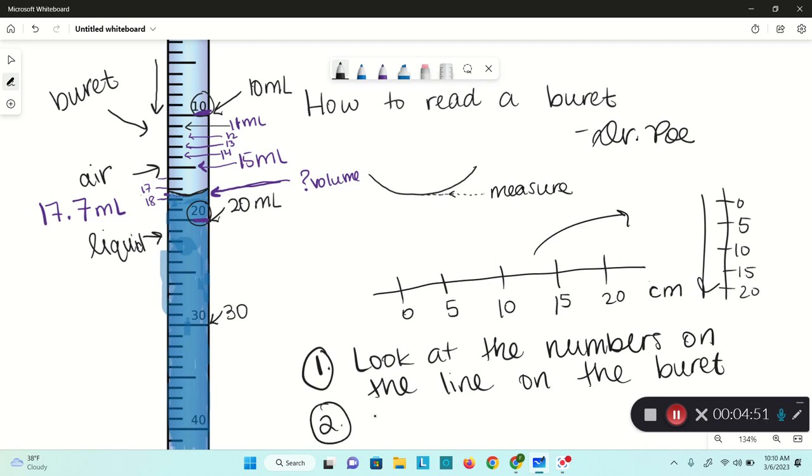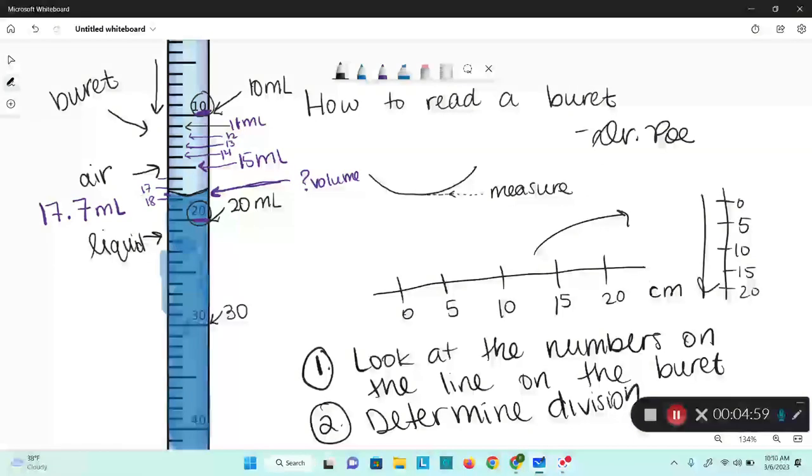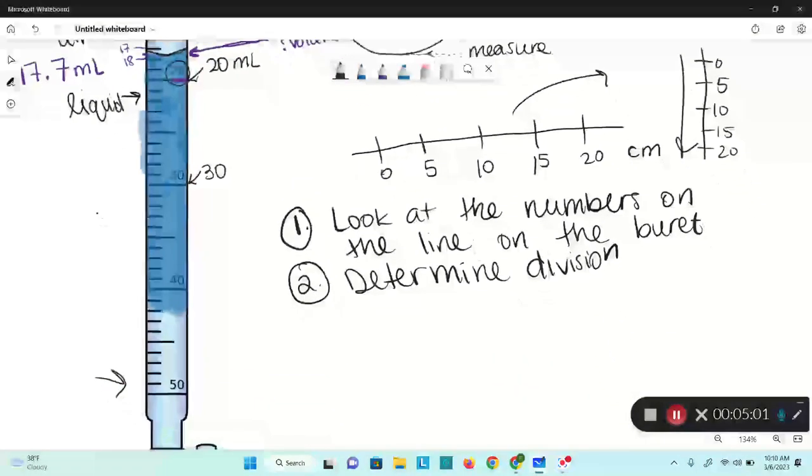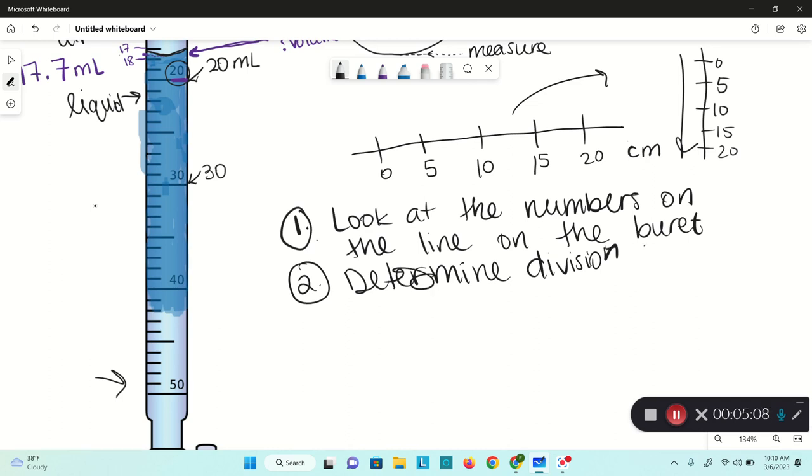Two, we're going to determine the divisions. What is each line worth? Determine the division value.